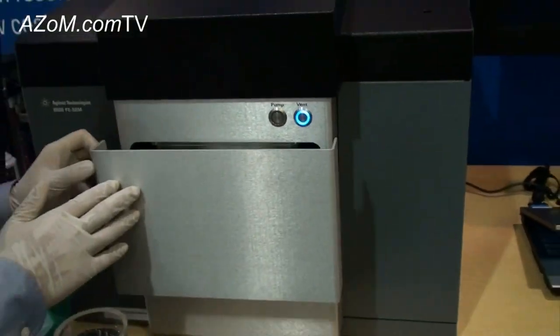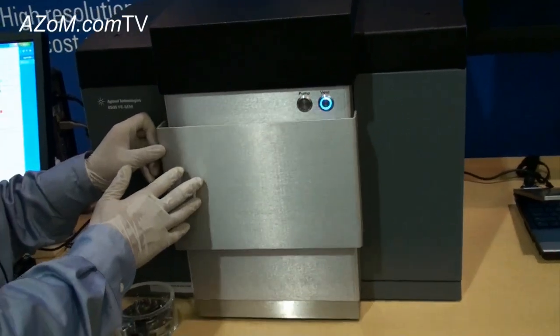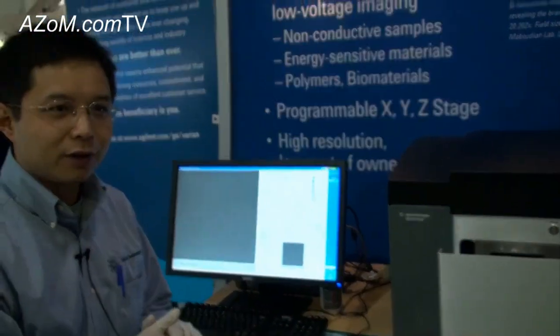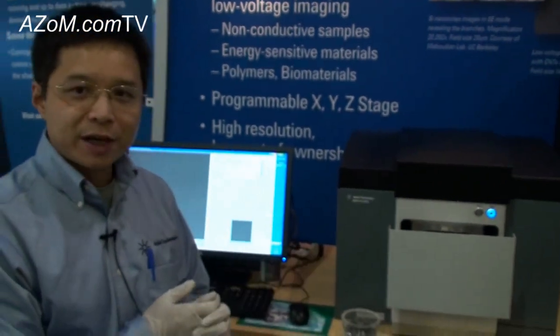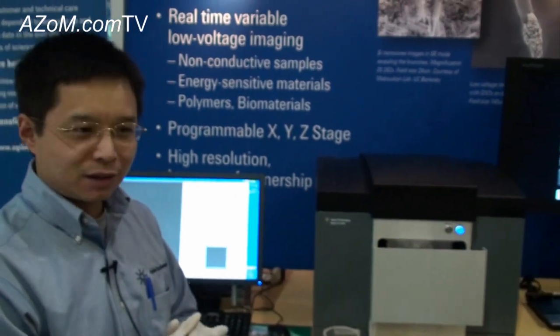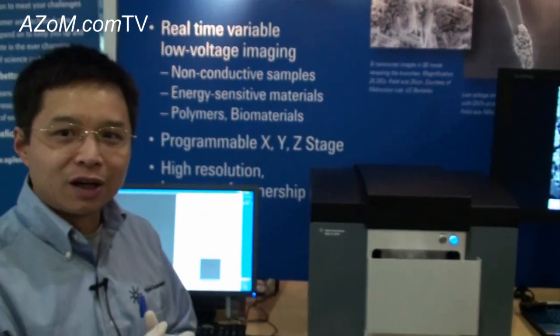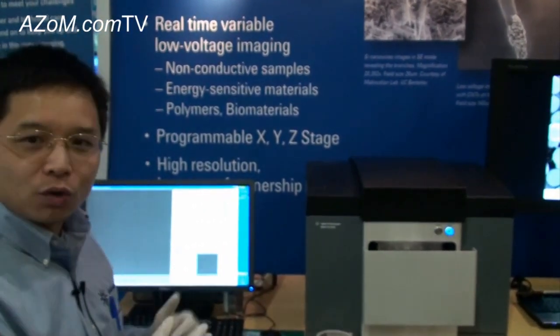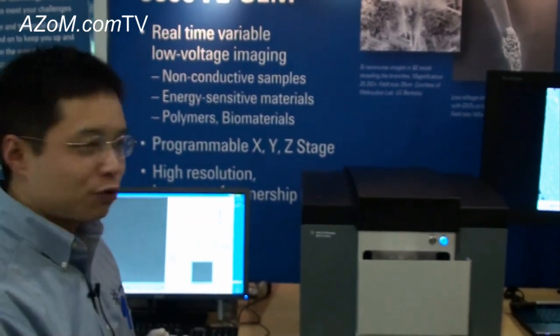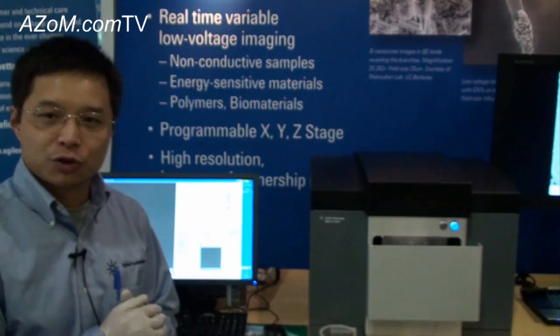Working at low voltage — does that also make it better for non-conducting samples? Yes, exactly. For SEM, a high voltage beam can generate a lot of charging for non-conducting samples, so our low voltage will definitely minimize the charging issue. We also have a backscattered electron imaging function, which can further help minimize charging.